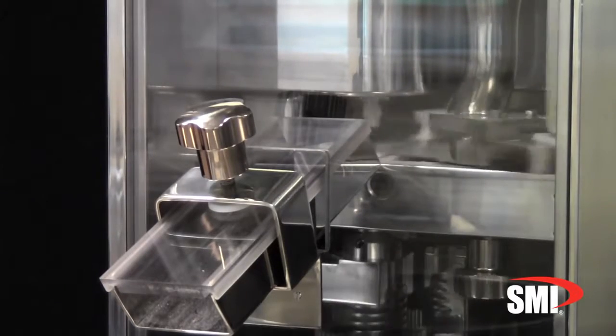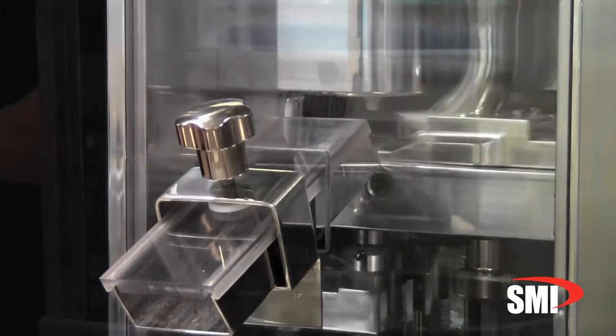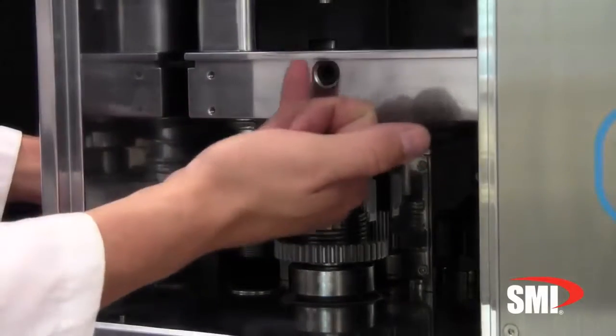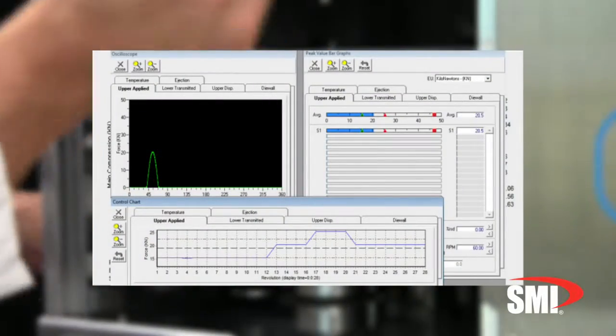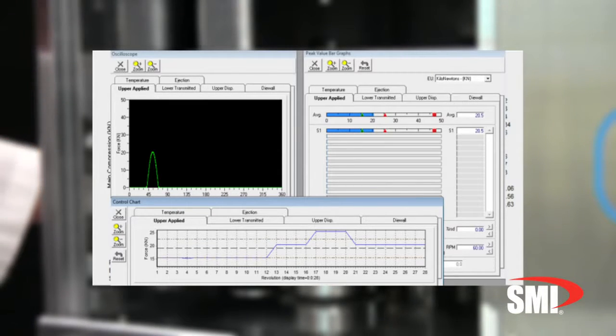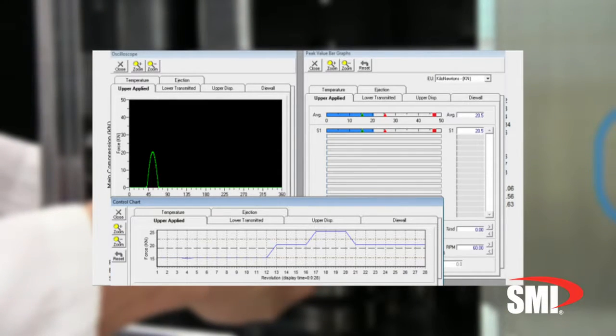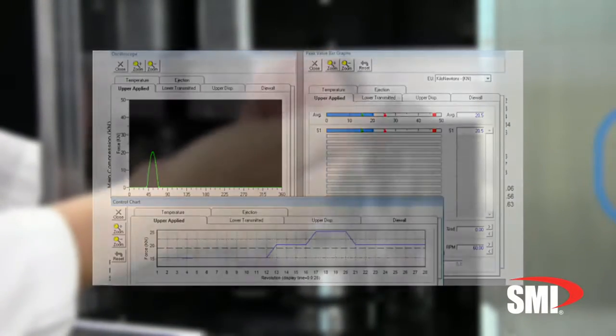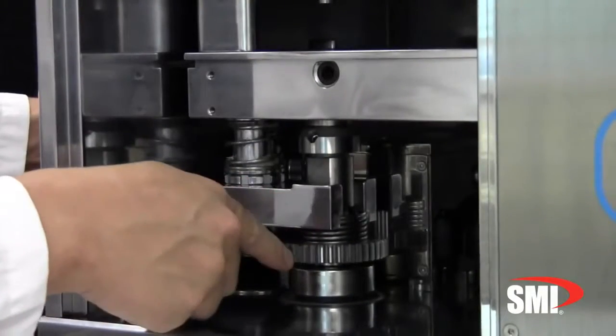The Director MiniPress module includes real-time displays for the upper punch applied force, lower punch transmitted force, residual die wall force, ejection force, temperature, and punch displacement for in-die thickness measurements.